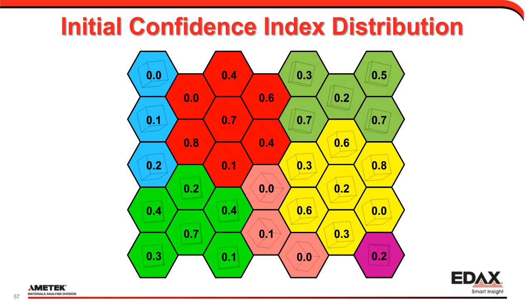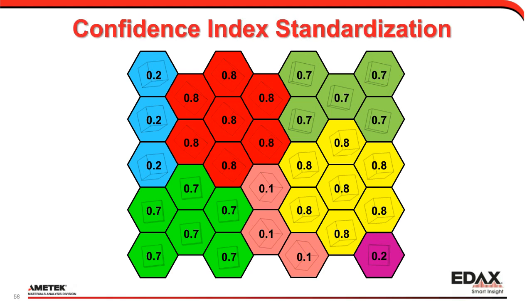0.2 is very asymptotic, 100%. And I probably should add that slide in here to some of the other talks, where again, even with a 0.0 CI, it's still on average more right than wrong with the orientation itself. So again, it's kind of a numbers game of saying, okay, my orientation to my friends is the same in my same grain. Let's go ahead and change my CI to be higher. And again, that's why I feel comfortable using something like the grain CI standardization to change those values and go from there.